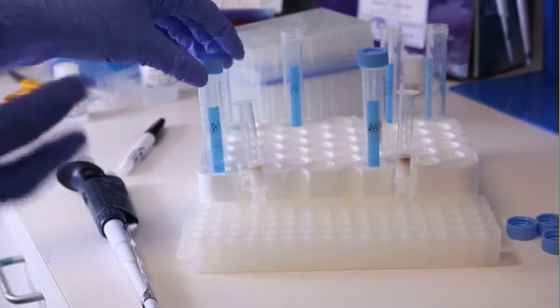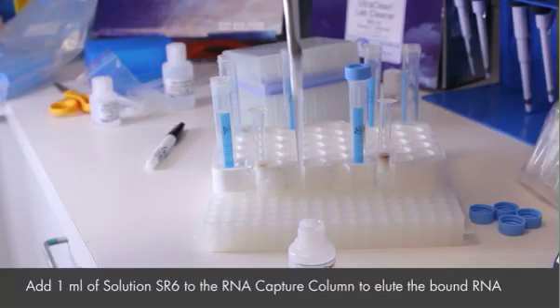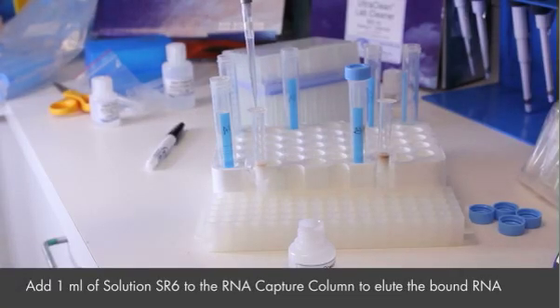Transfer the column to a new 15 ml or 2.2 ml collection tube. Shake solution SR6 to mix and then add 1 ml to the column to elute the bound RNA.